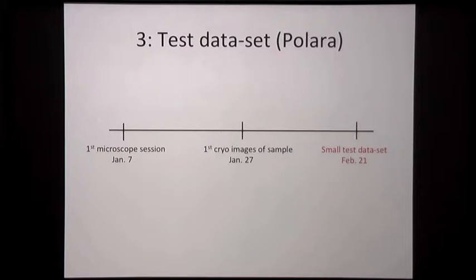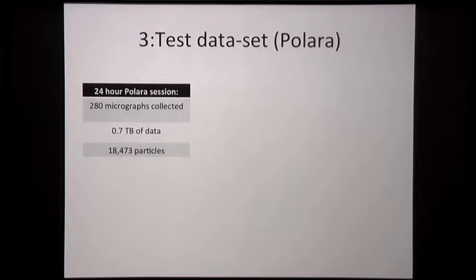So I had my first session on the Polara in late February and was able to collect a very small data set, or moderate-sized data set, I guess, of about 280 images, resulting in about 18,000 particles.